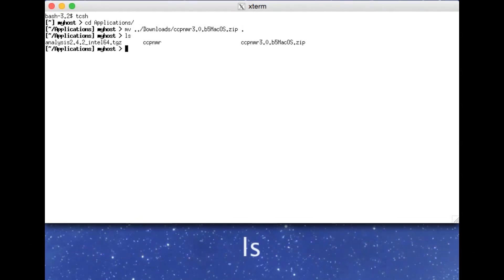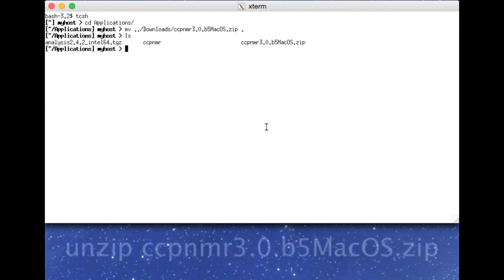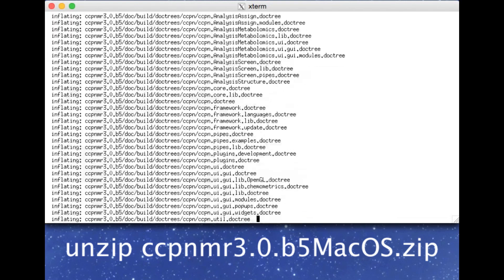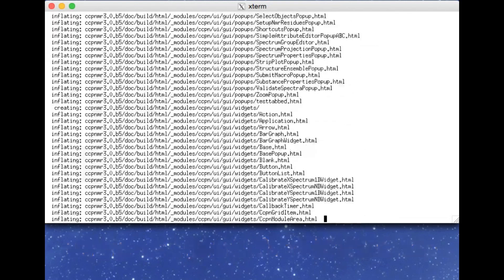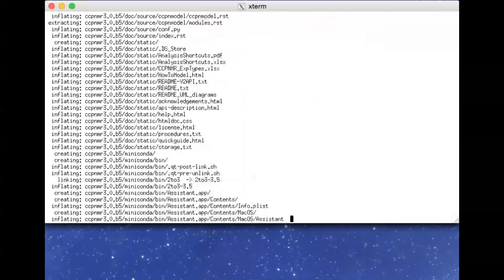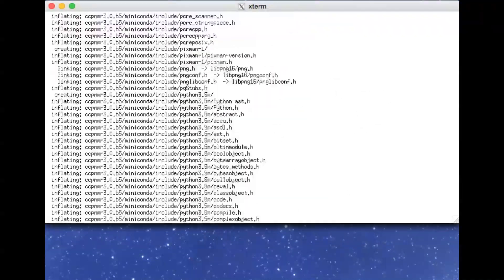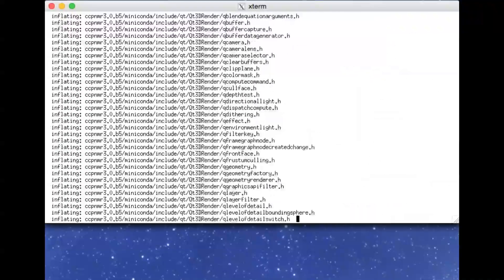And with list, I can see that it is indeed here. And then I just need to unpack it, which for a zip file you do with unzip. And then it may take a minute or two to fully decompress.